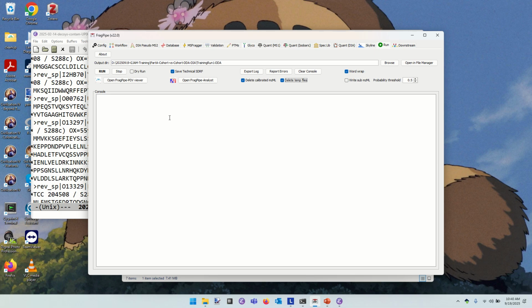Oh, you already hit the run button. Well, I don't know if I did. I have it. Yeah, okay. It's just Python being mouthy.